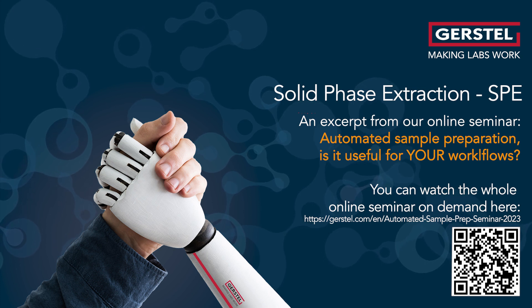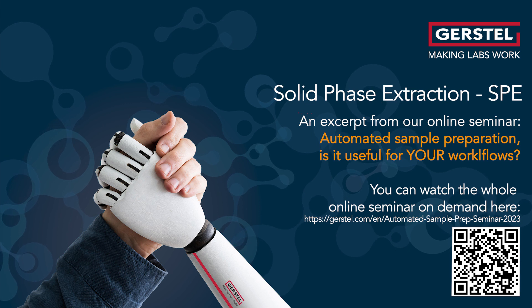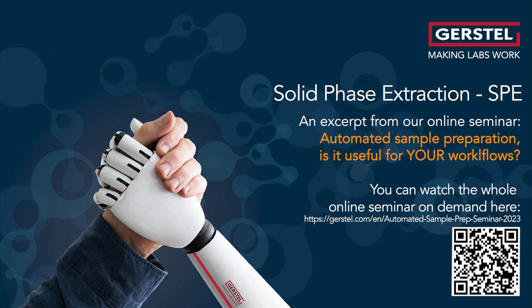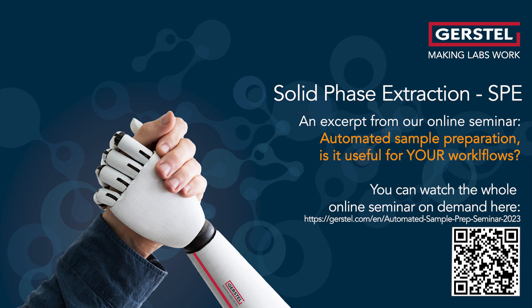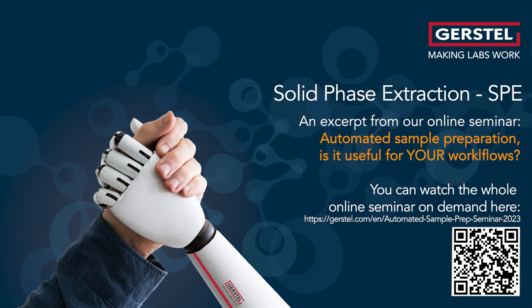In this video we show you possibilities for automated sample preparation. This is an excerpt of an online seminar from January 2023. In our YouTube playlist you will find more automated workflows as well as an overview of possibilities to automate your own sample preparation workflow.